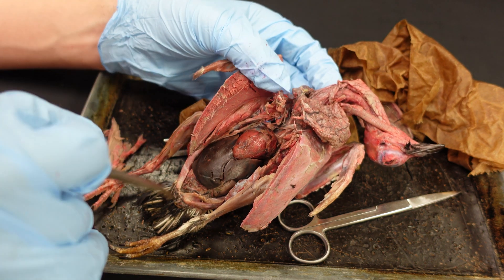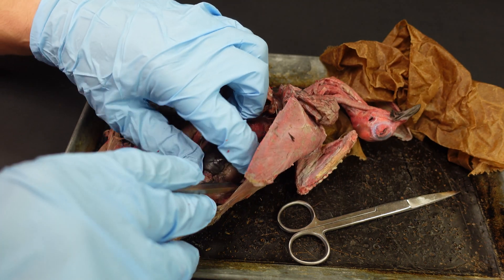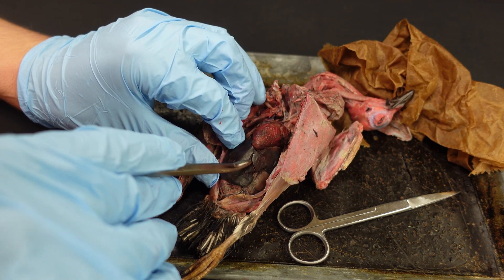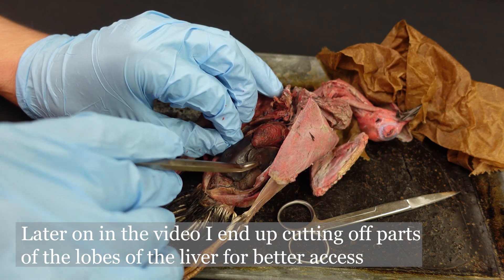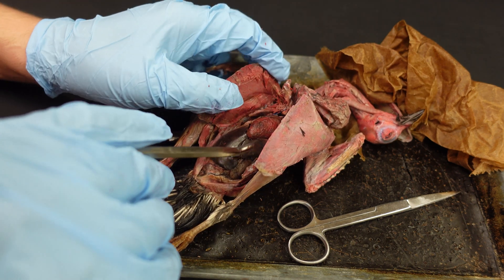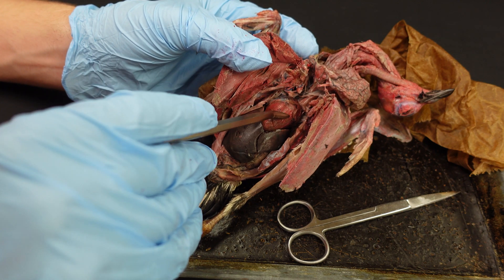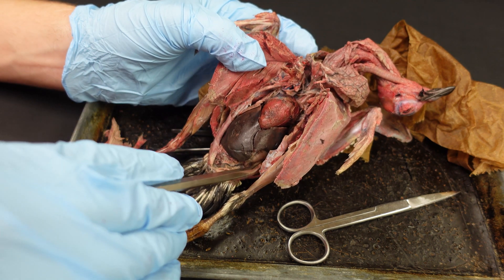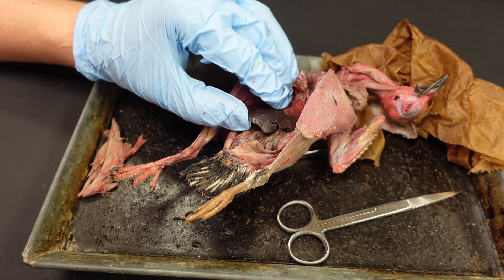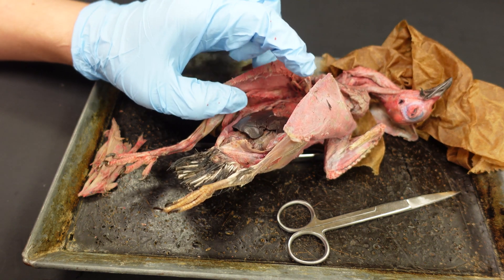This is going to take quite a bit of time to get all these organs separated so we can see underneath them — they're really tightly bound together and you might damage the liver quite a bit as you do this. Before moving on, let me identify the key organs: the heart is here, here's the liver, there's the stomach, and the intestines are down here.